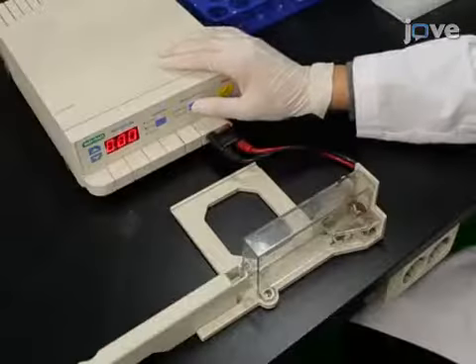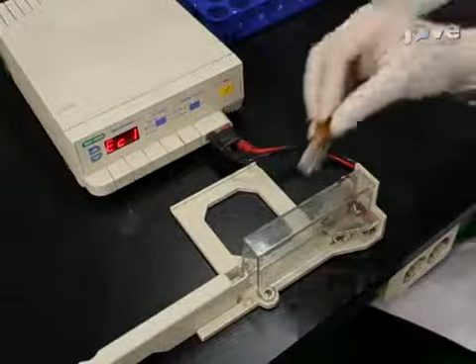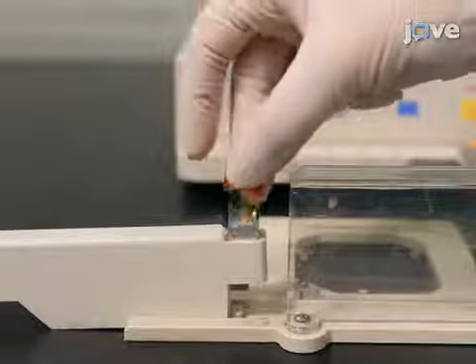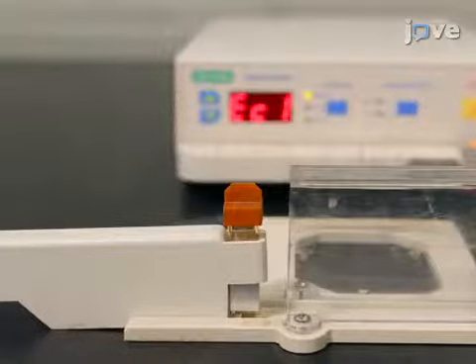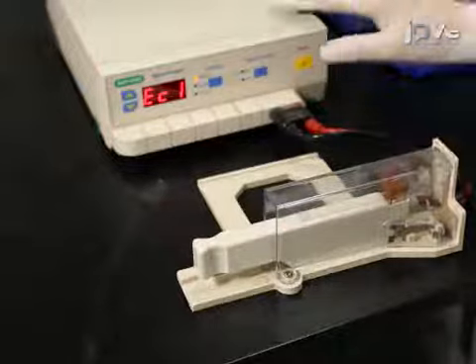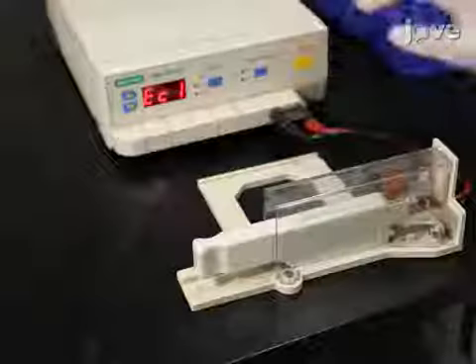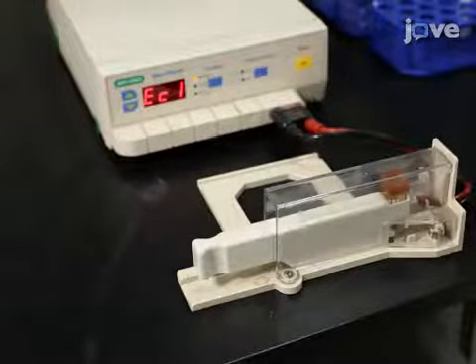Set the electroporation machine to 25 microfarads and 2.5 kilovolts. Then, insert the cuvette into the slide of the shocking chamber. Push the slide into the chamber until the cuvette makes firm contact with the chamber electrodes. Press the pulse button once until the electroporation machine beeps.